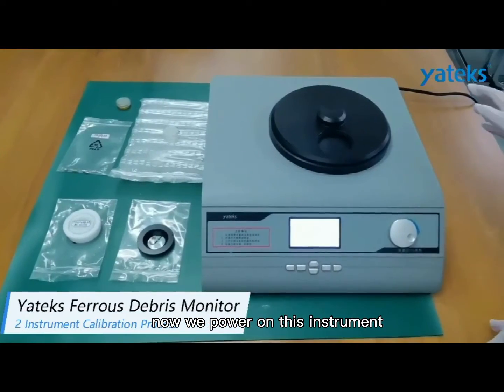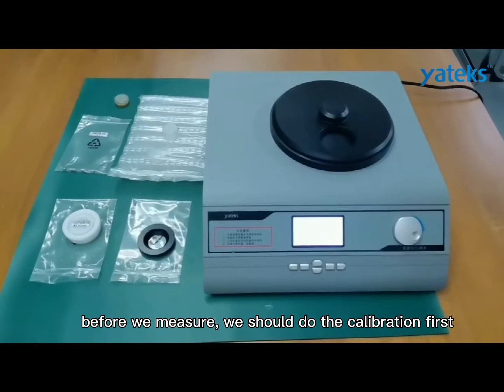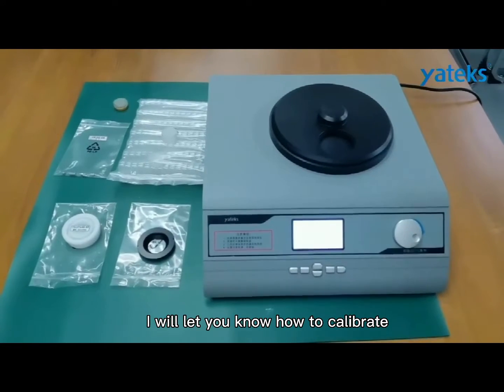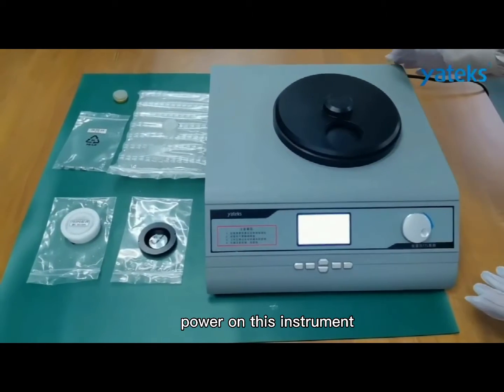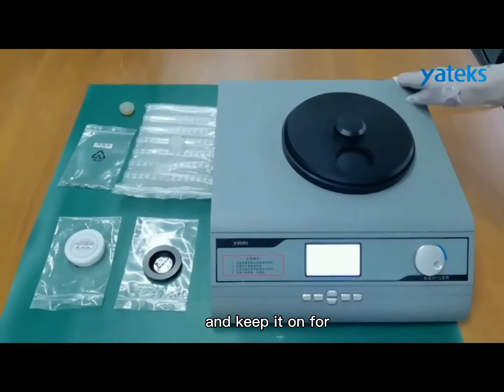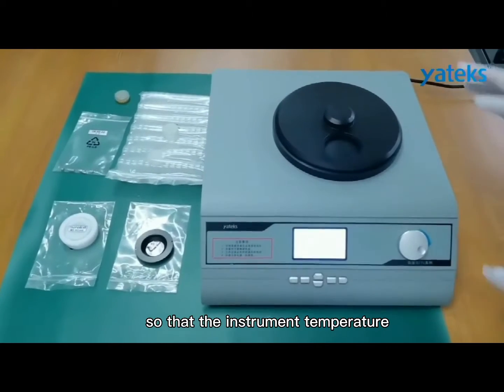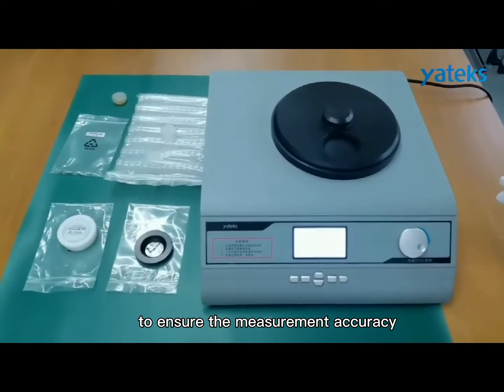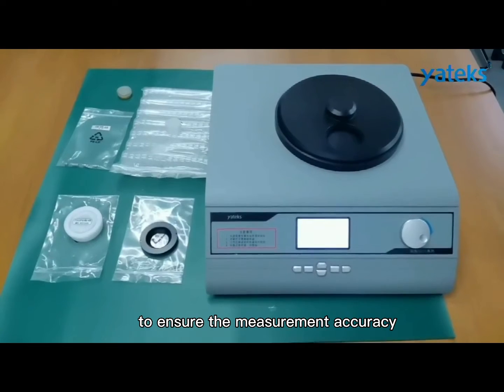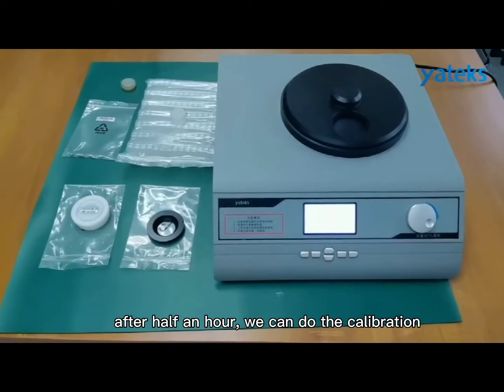Now we power on this instrument. Before we measure, we should do the calibration first. Power on this instrument and keep it on for at least half an hour so that the instrument temperature can be suitable to ensure measurement accuracy. After half an hour, we can do the calibration.